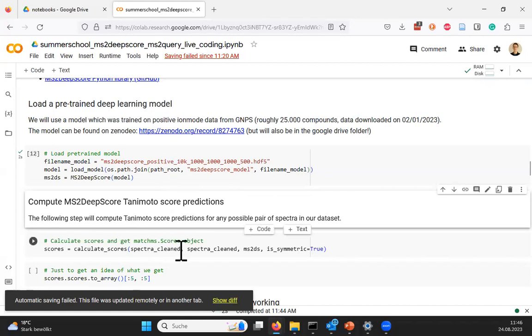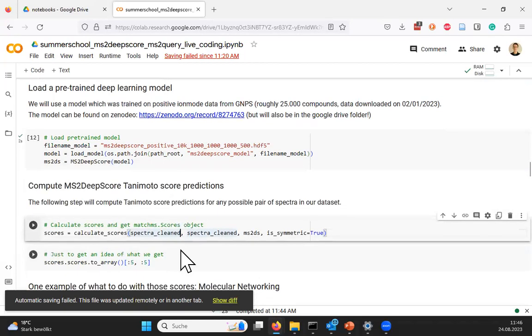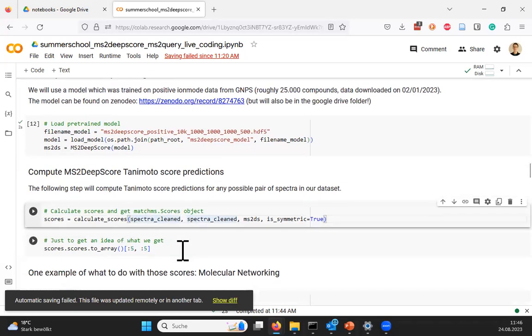Let's say you have this imported, then you can do something, and that is a bit slower operation. You could do scores. I'm skipping this on purpose now because that is the slow part. We can do this live, but in view of time, I'd like to jump ahead a bit to a second use case. I mean, we could do something like this. We could compute the scores.